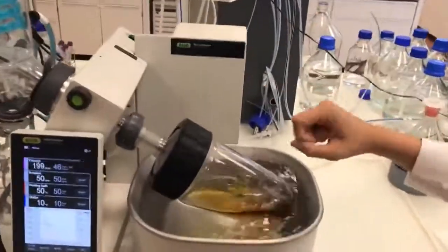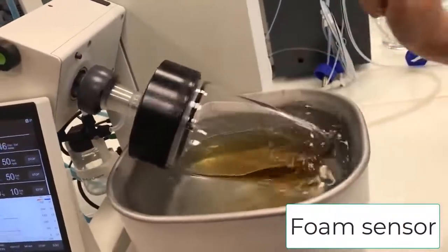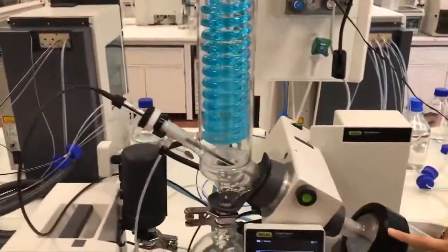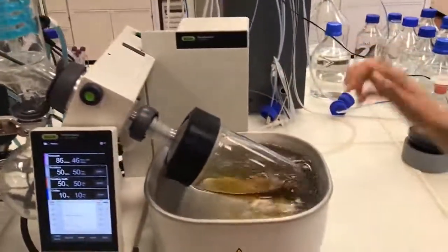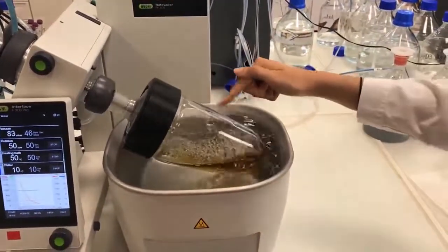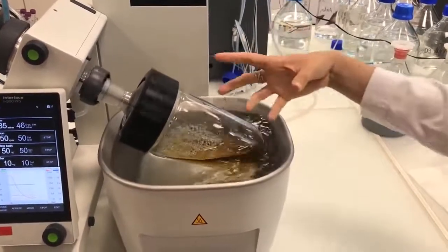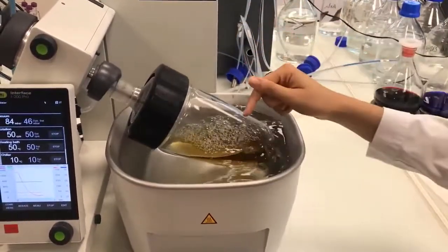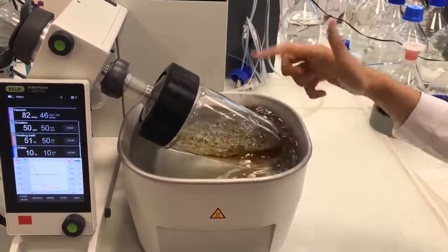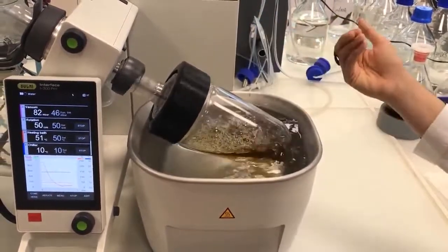I don't know if you've seen it before, but I have in my flask what we call the foam sensor. As you can see, it's here. It comes all the way from here and it goes down onto the flask. So what's the point of the foam sensor? Okay, we'll see first. There you go. That's the point of the foam sensor. So you have foam starting, and then automatically the system will see the foam and it will break the vacuum. It will aerate the system a bit automatically, so that again the foam breaks.